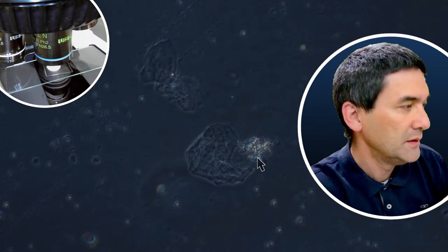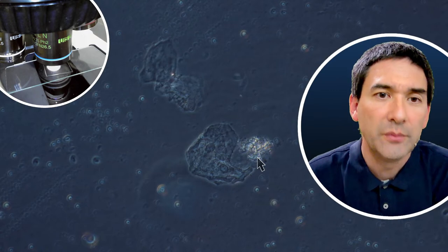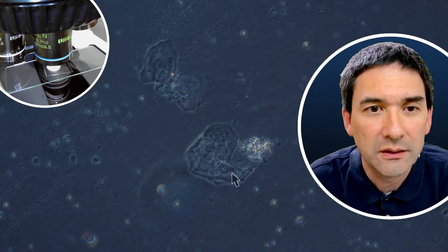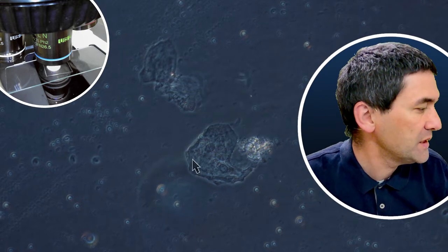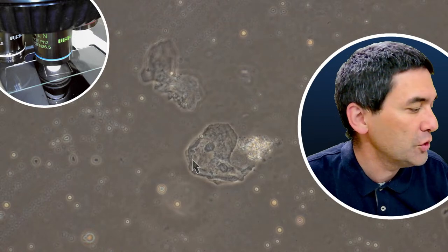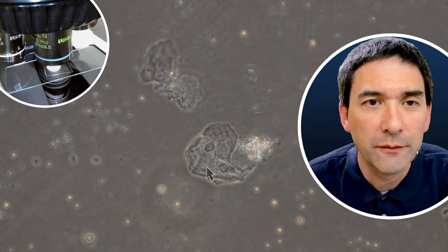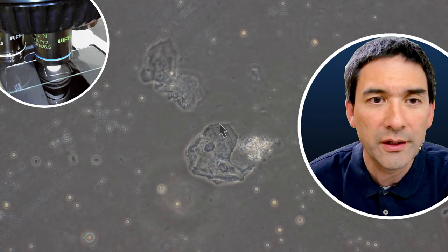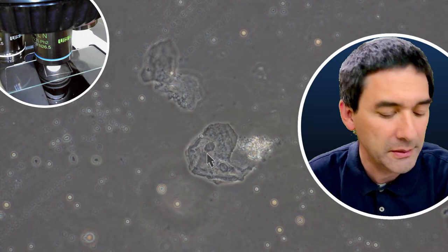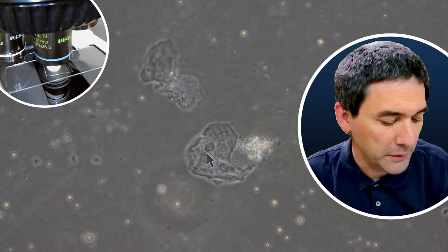I need to turn up the brightness a little bit here as well on the camera. And what you see already is that you see again the nucleus and actually also much more structural detail. So you see that essentially it's exactly the same specimen, but now with a different surrounding mounting medium, in this case water, and therefore the difference in refractive index already has quite a significant impact here. I just wanted to show this as a demonstration, for the sake of completion, I just wanted to compare this.